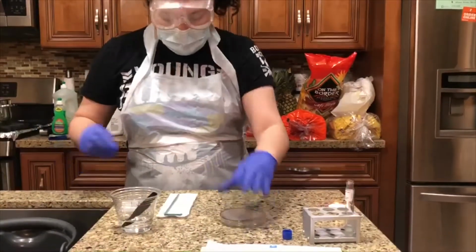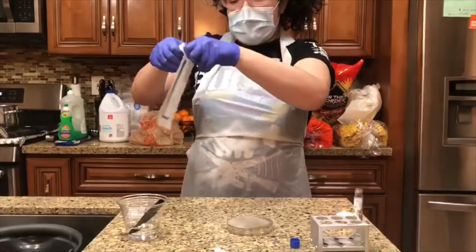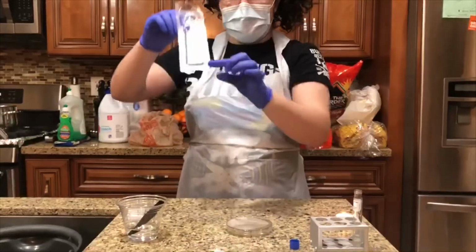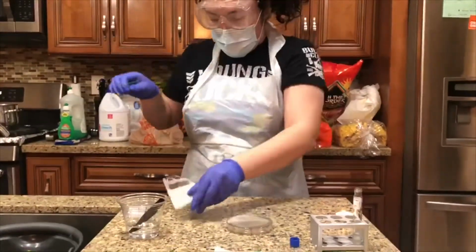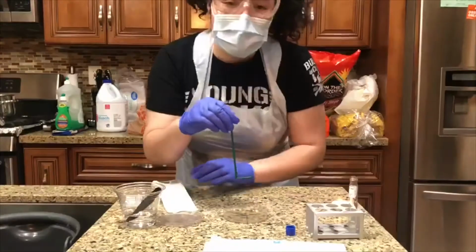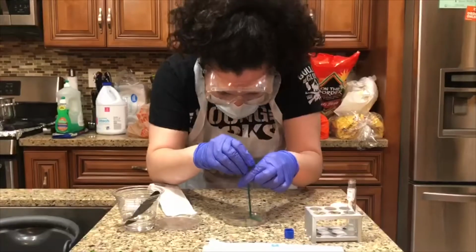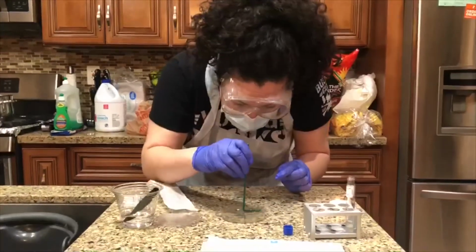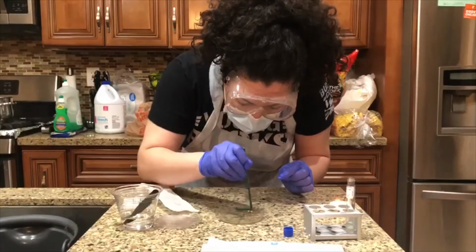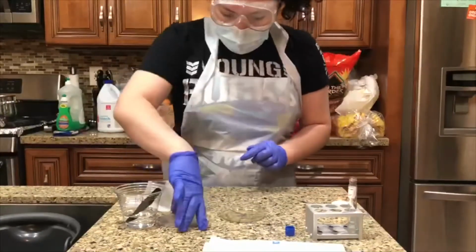Cover my agar plate. Then I'm gonna get this thing right here. I'm just gonna touch the tip of the long part. So it's a straight long thing right here. So I'm gonna leave the bottom part sterile. I'm gonna remove the lid of the agar plate, and then I'm gonna evenly distribute this active culture in the agar plate. Okay, get this, throw it in the bleach that I have right here. Cover my agar plate.